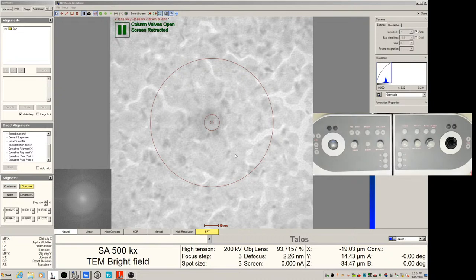In fact, right now at our sample, our defocus is actually zero, or very close to zero. So we can just think the defocus is now zero, and then we want to change the focus to the under focus, counterclockwise, to about 50 nanometers. Remember we started from 2, and right now we are at negative 64, so we changed about 66 nanometers under focus. See, right now it's a negative value, because we are under focus. On the under focus side, the focus value is going to decrease.